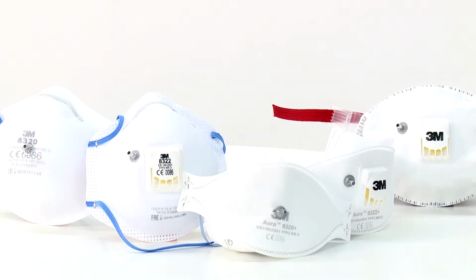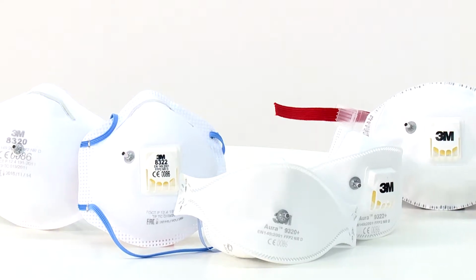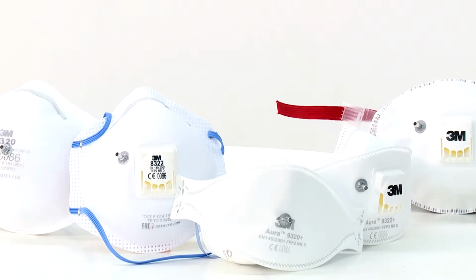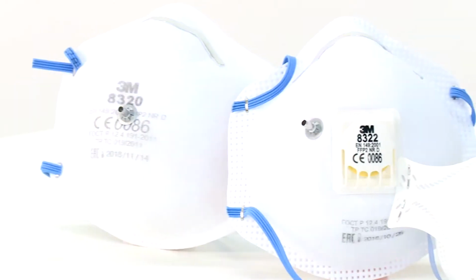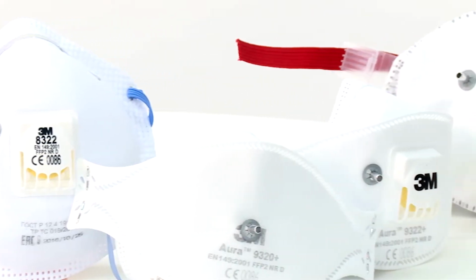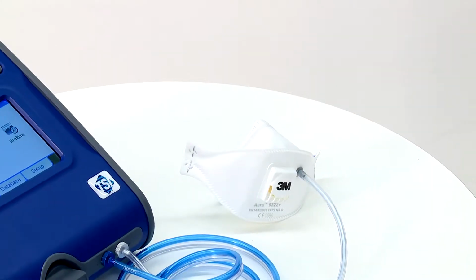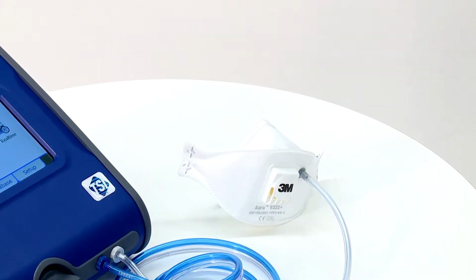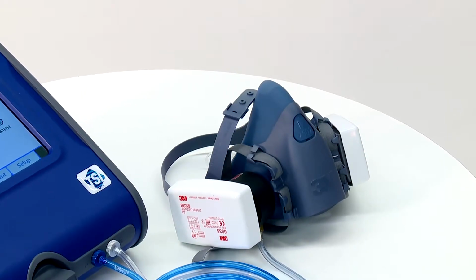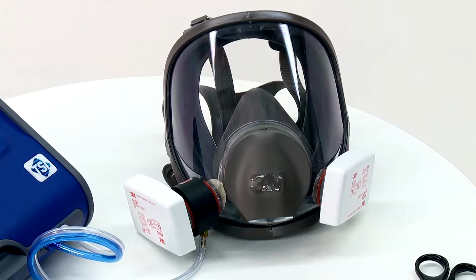Hello, and welcome to this video demonstration of how to prepare and fit test 3M tight-fitting respirators using the TSI PortaCount Quantitative Fit Testing Machine. In this video, we will cover how to prepare a selection of 3M tight-fitting respirators for fit testing. For detailed instructions on how to set up, operate a TSI PortaCount and conduct fit tests in accordance with established national protocols, please see the link shown at the end of this video.